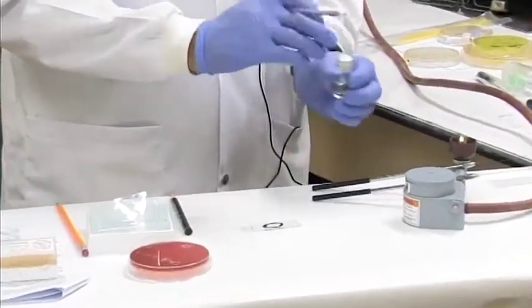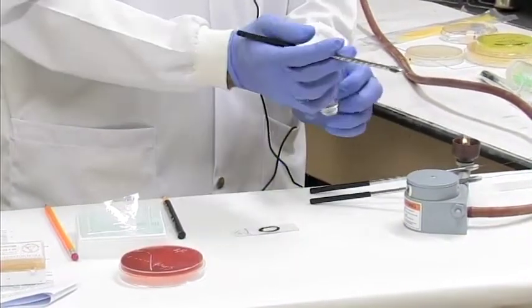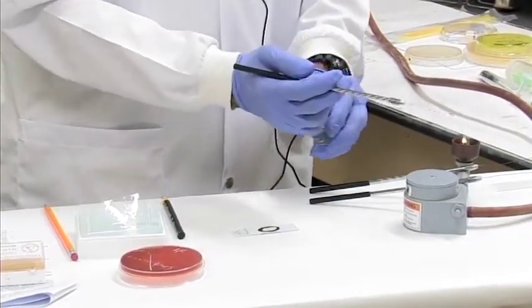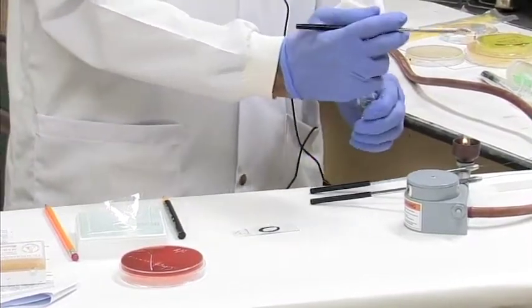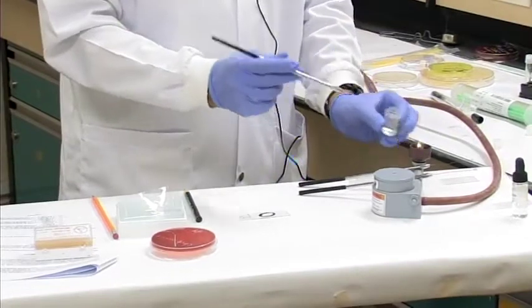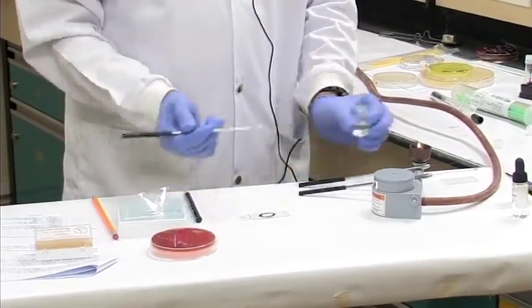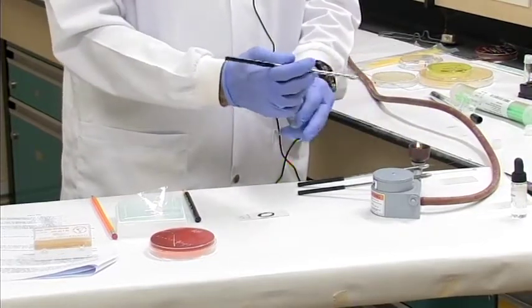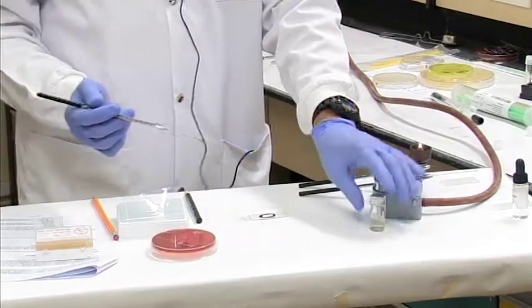And you want to handle tubes aseptically. So the proper way to handle tubes and cultures, let's say, for example, you're going to open this tube: you open it like this with the small finger of the other hand, flame the top, go into it, remove your liquid, place it on, flame again, and cap it back like this. That's the proper technique to handle your tubes when working in a microbiology lab.